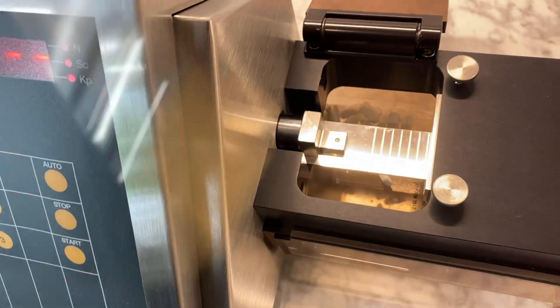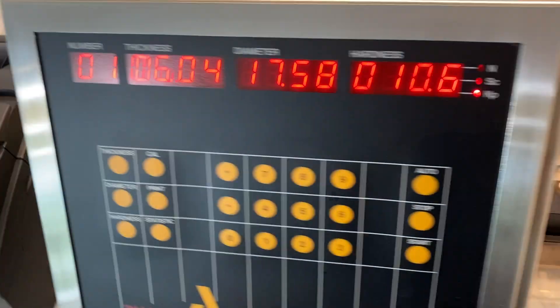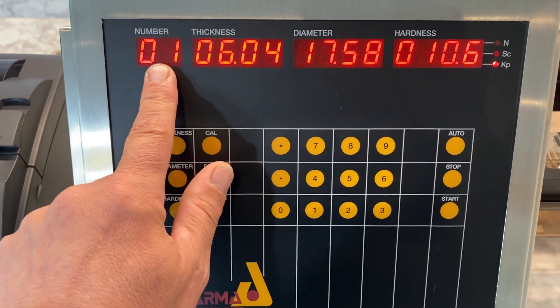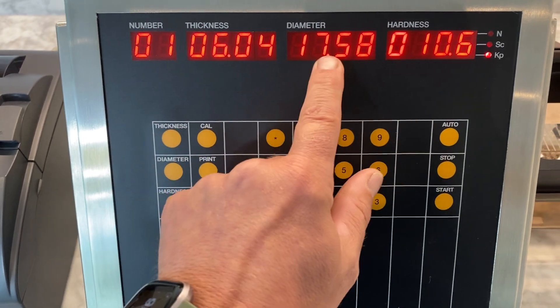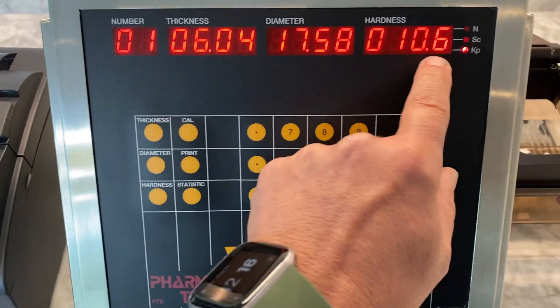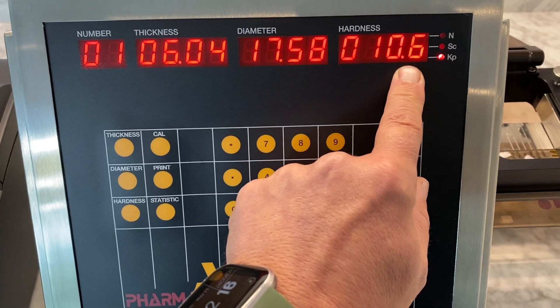Sweep the broken tablet away. The results for the first tablet are displayed: thickness, diameter, and hardness. We can measure in millimeters or inches, kiloponds, Strong-Cobb, or Newtons for hardness.